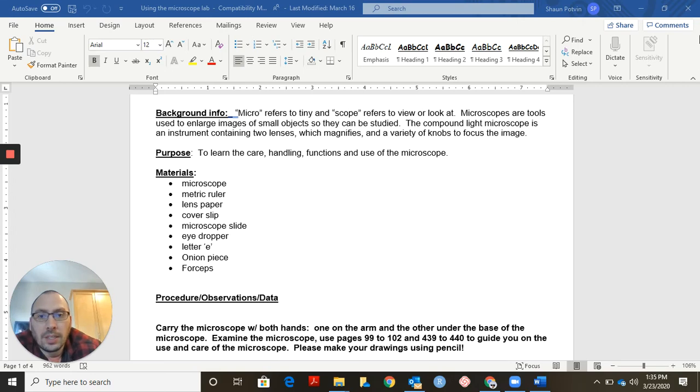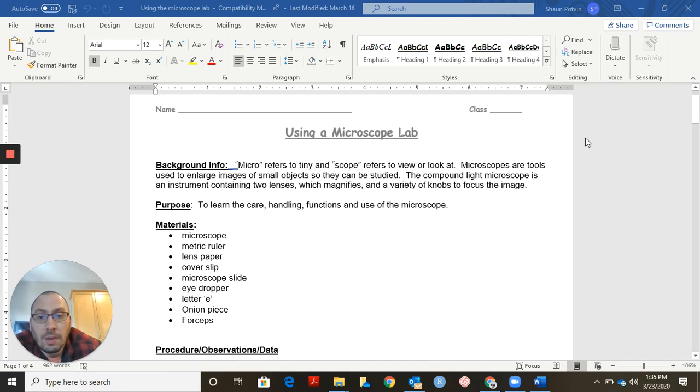Hope everything's going all right. Thank you, those of you that have been working really hard on the lab. Some of you have been having some really good questions. So because of that, I thought I'd run through it one more time. I know a lot of you are missing, so hopefully some of the things that I'm going to show you here will help you out, okay?